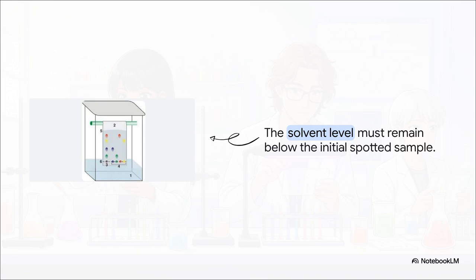If the solvent level is even a little too high, our precious sample compounds will just wash away and dissolve straight into the solvent pool at the bottom. The entire experiment would be ruined. So it's a very delicate, high-stakes balance.